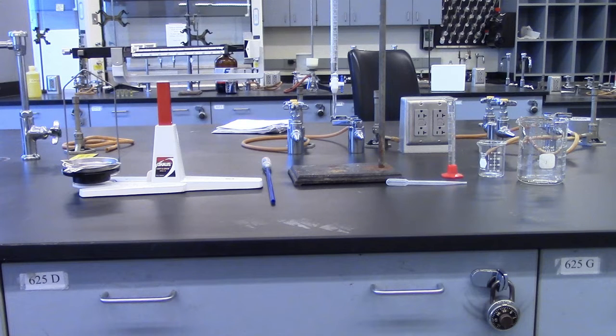For this experiment, you will need a balance and thermometer, a 50 milliliter burette, a 10 milliliter graduated cylinder, and beakers size 50 milliliters, 100 milliliters, and 600 milliliters. A plastic pipette will be helpful.